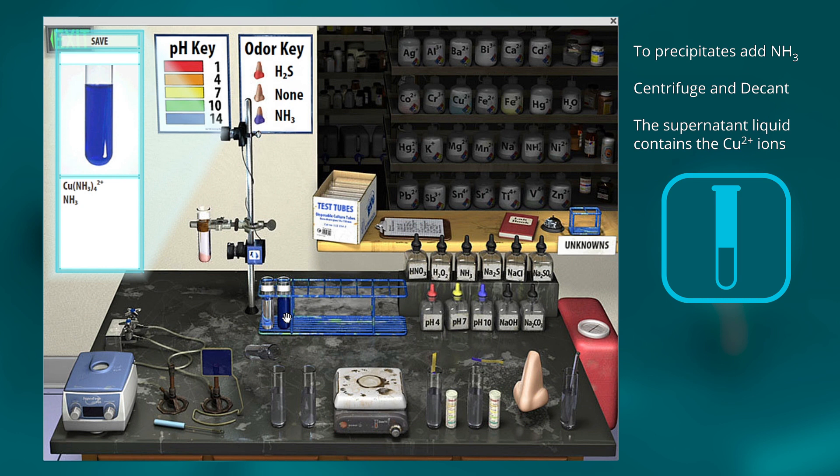And now in this tube, I've separated off the copper. So that's how we separate out copper, making it hydroxide, then adding the ammonia.